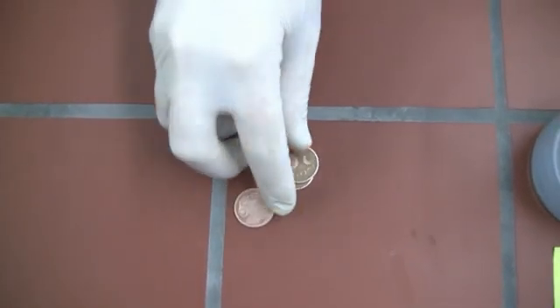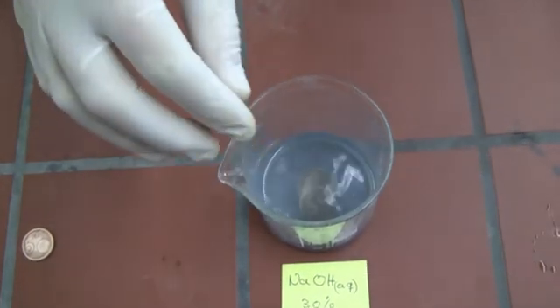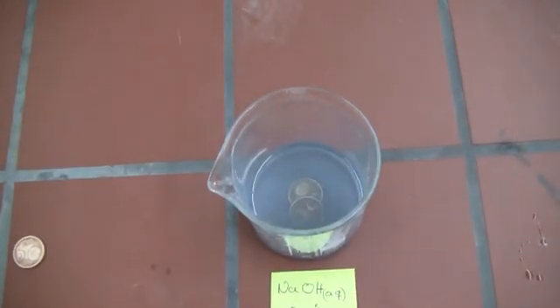Then we put the coins in a beaker with a solution of sodium hydroxide and 1.5 gram of zinc metal powder.